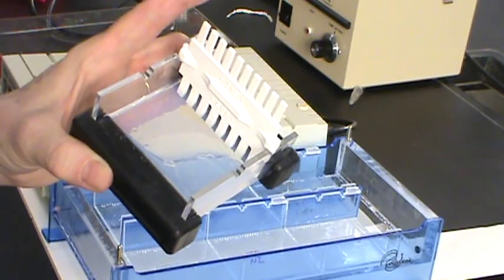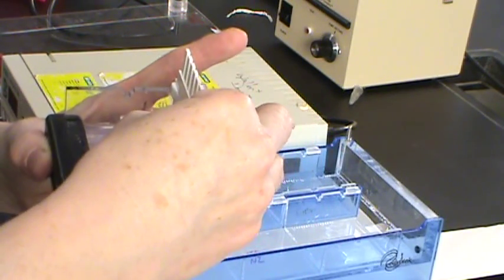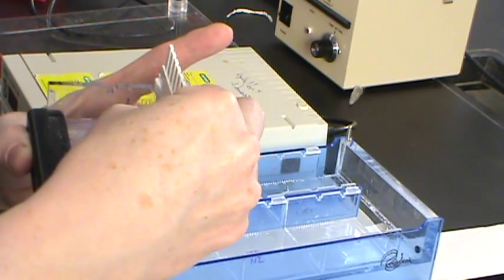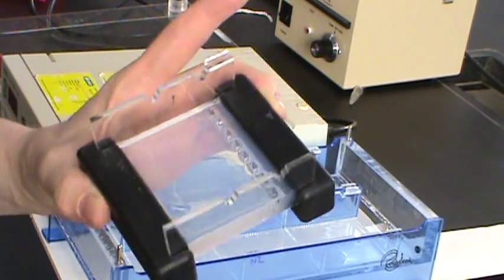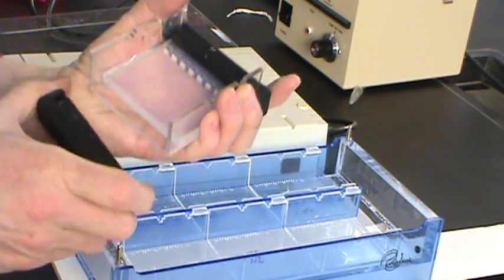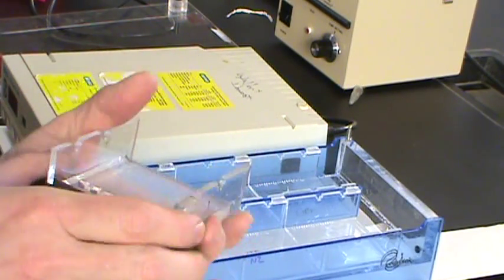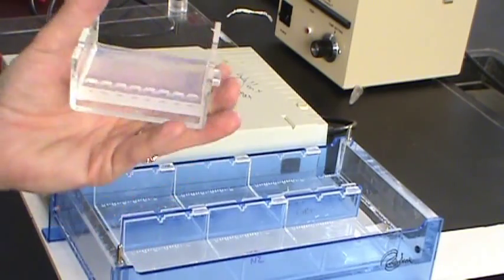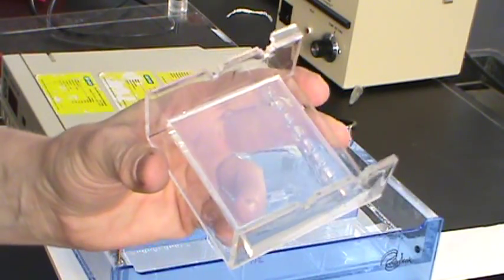If you were pulling these combs out, you would pull them out just straight up and down, because we don't want to break the gel. And we should have lots of nice little 8 little wells across here. The other tricky part is to get these dams off without losing our gel, so we want to take those off carefully. And so we have an agarose gel that looks like this.